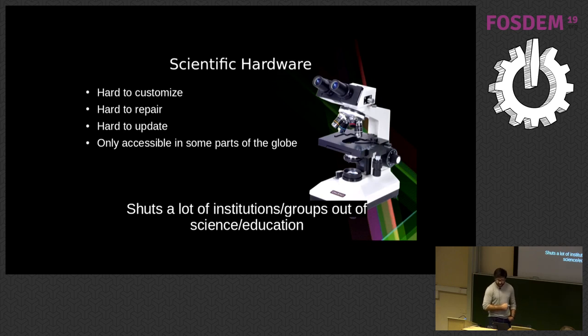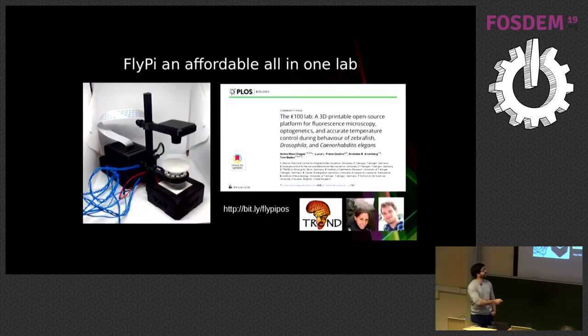So working with Trend in Africa, together with Lucia and Tom, we started playing around with hardware. This was about 10 years ago when we first started. And we found the Arduino platform, and we started as biologists, you know, very simple: blink an LED, read a temperature sensor, and things like that. We started applying this, and things got more complex over time.